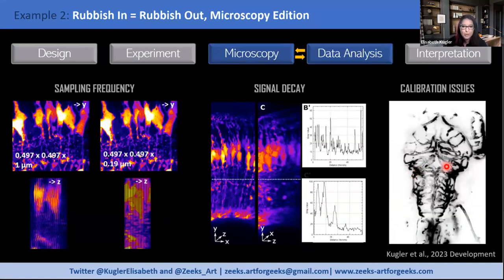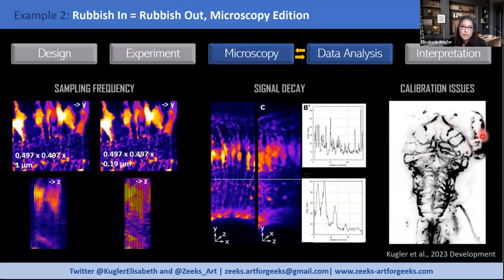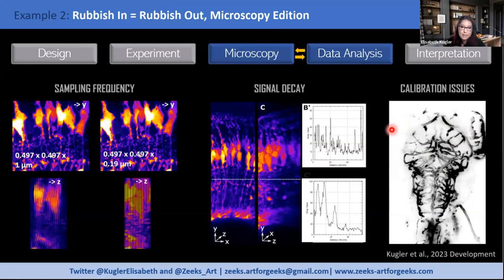The third example is calibration issues, shown here from light sheet microscopy. We look at brain vessels of a zebrafish as a maximum intensity projection. If this is the left brain hemisphere and the right, you'd expect equivalent data on both sides. But certain structures are invisible on one side because the light sheet wasn't accurately aligned. If asked to quantify the same feature on both sides, I would have to say I can't — because I can't see it. Getting data quality right before analysis is essential.